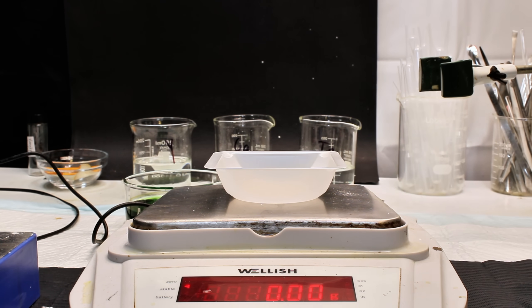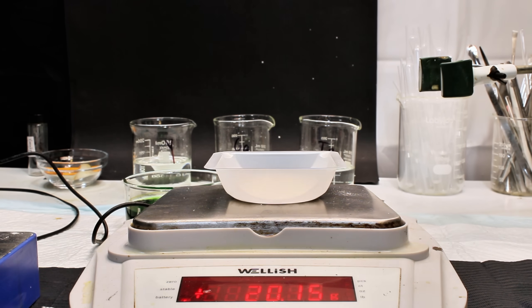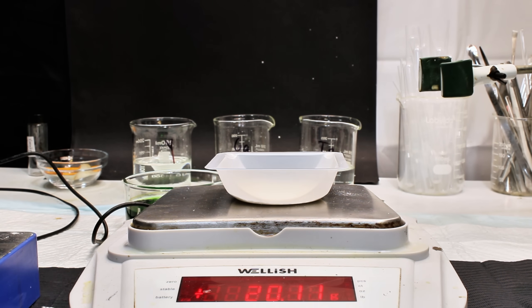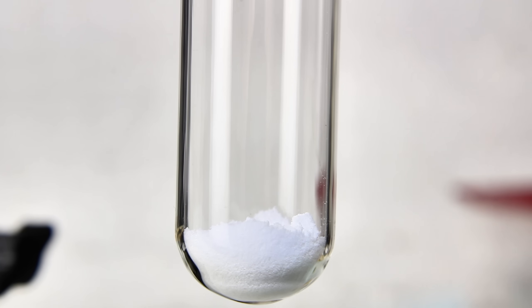Even though accidentally making sodium iodate is what prompted me to come up with this purification procedure, it's something I'm really happy with and something I plan to do in the future, regardless of whether sodium is involved or not. Now that I had finally made some very pure potassium iodate, it was time to make my polyhalide salt.